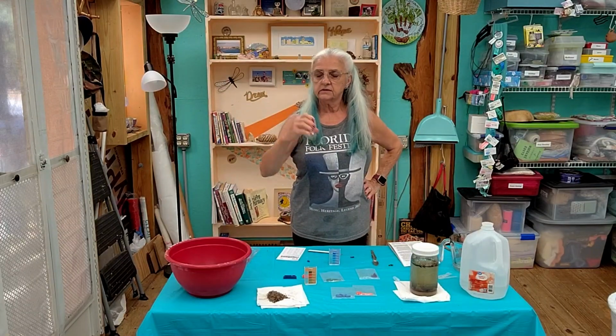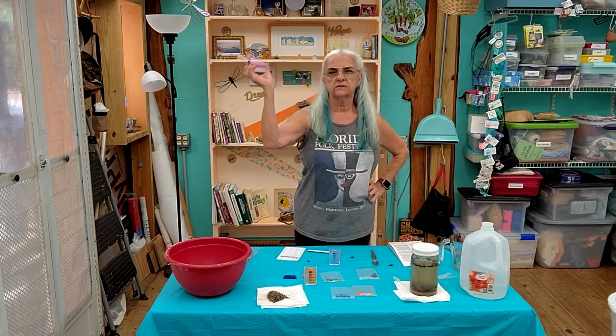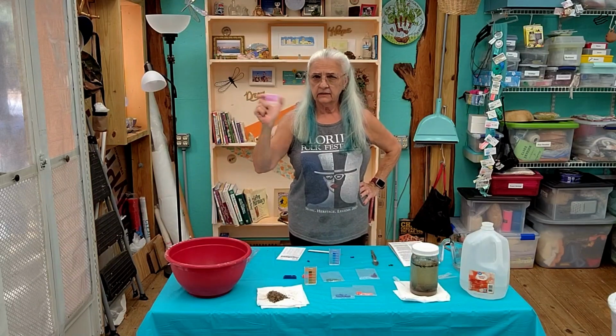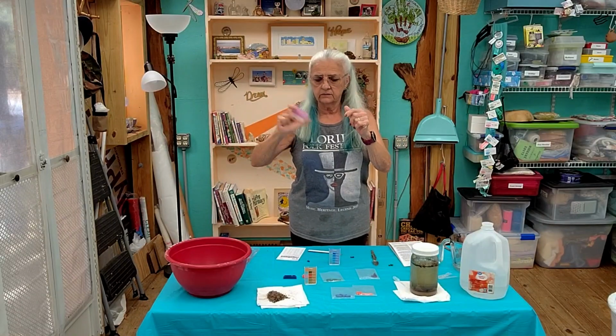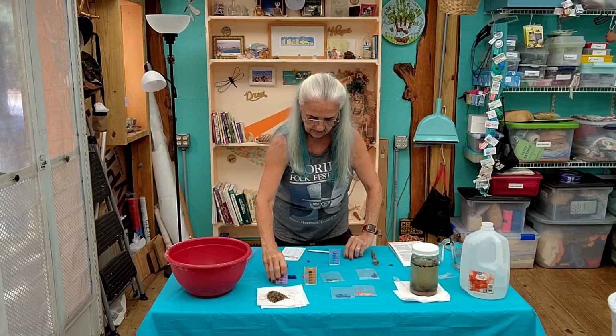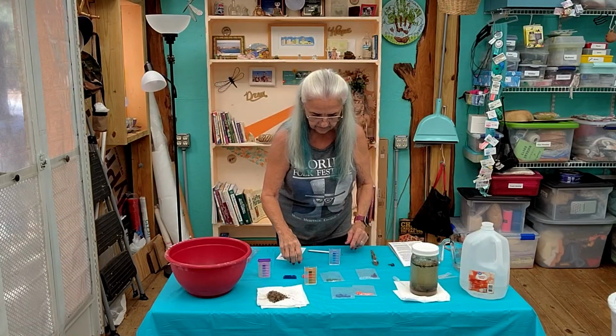And what I found is that even though you shake it, sometimes the weight still settles on the bottom. It could be that the last one I did was older and I was dealing with the capsules melting. We'll find out. I bought a fresh kit because I wanted a good reading.